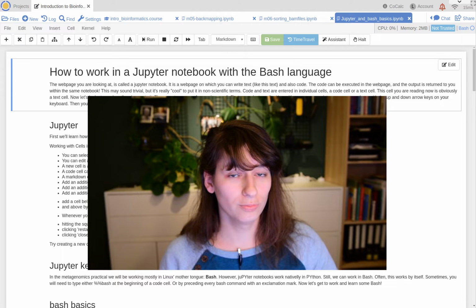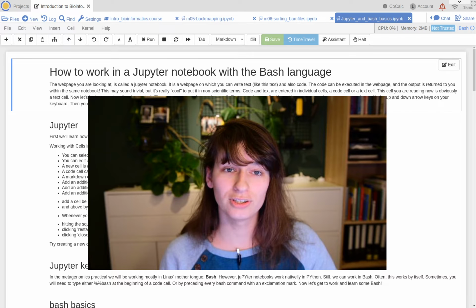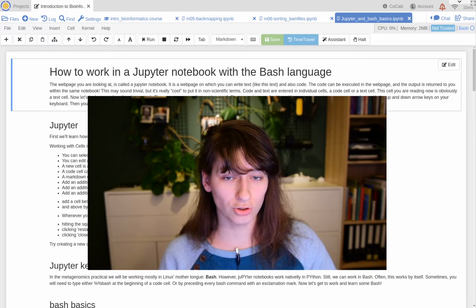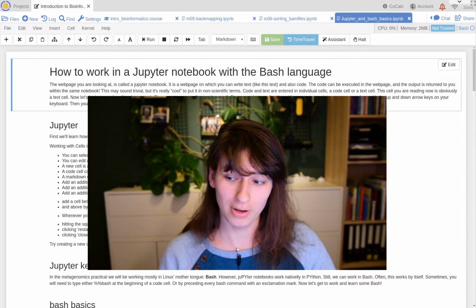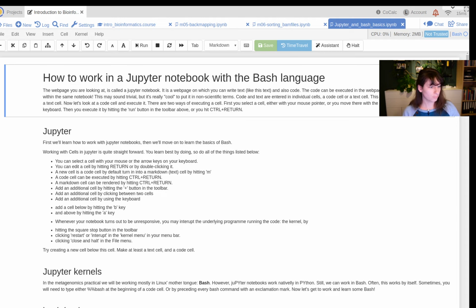What I'll do is advise you first to make this primer by yourself. There's a lot of instruction in there that should get you quite a long way. And then if you're stuck, you come back to this video and I will explain all steps to you. Assuming you've now done the exercise, let's have a look.